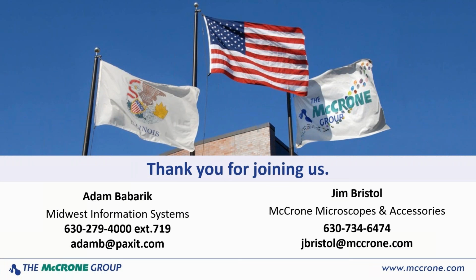And that becomes a significant concern for most labs that we deal with. So purchasing our integrated camera is a little easier for everybody, but as long as you have the appropriate checks and balances in your lab environment with a third-party camera, we're definitely willing to explore the possibilities with you.